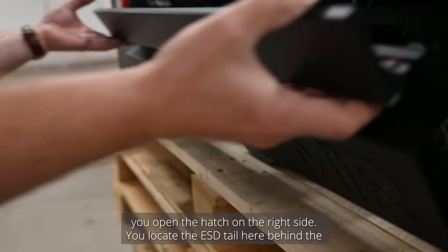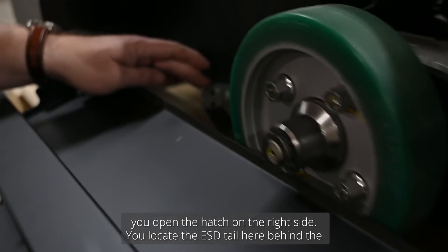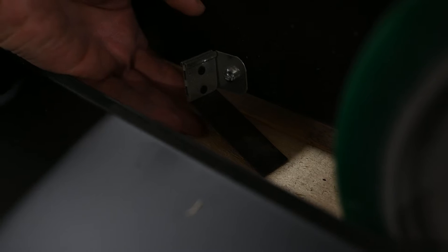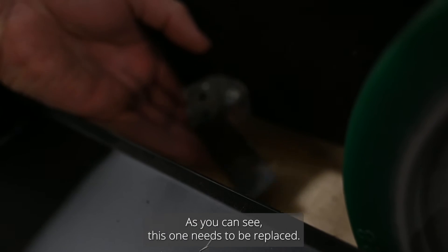To inspect the ESD tail, open the hatch on the right side. Locate the ESD tail behind the drive wheel and check that it's properly fastened and touches the ground. As you can see, this one needs to be replaced.